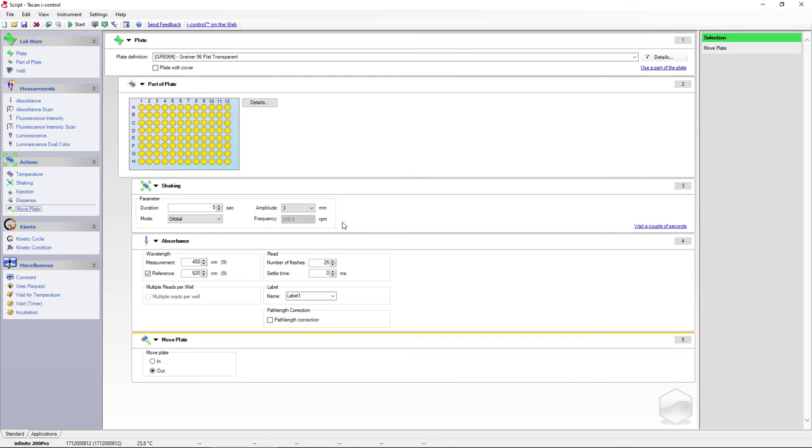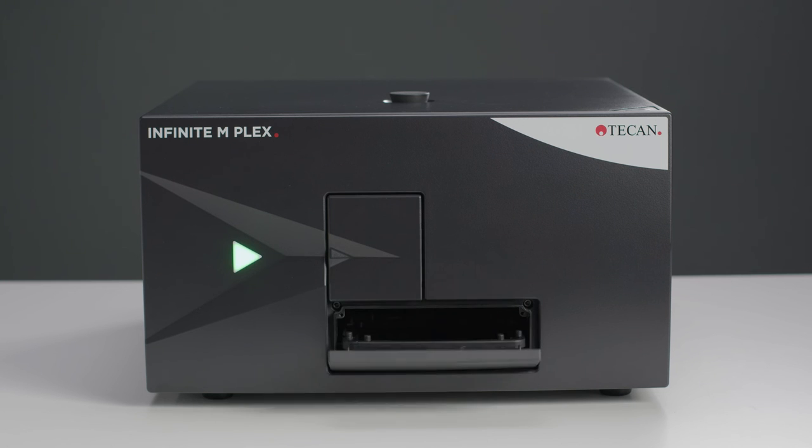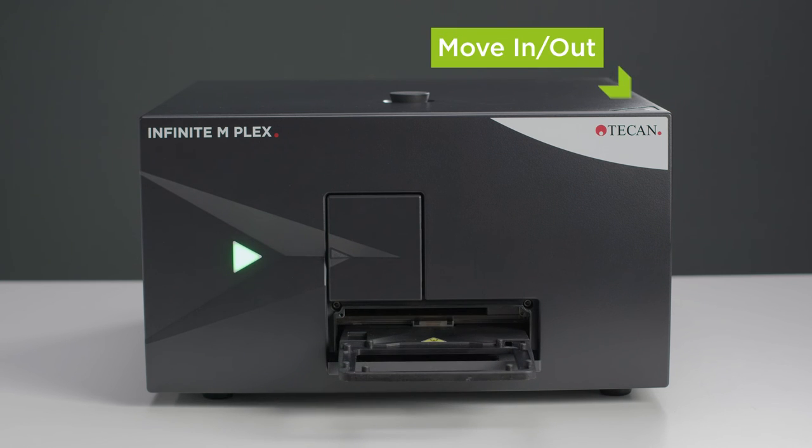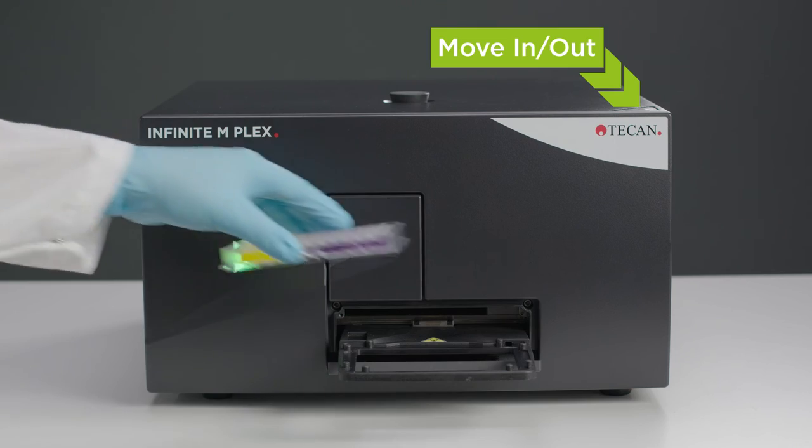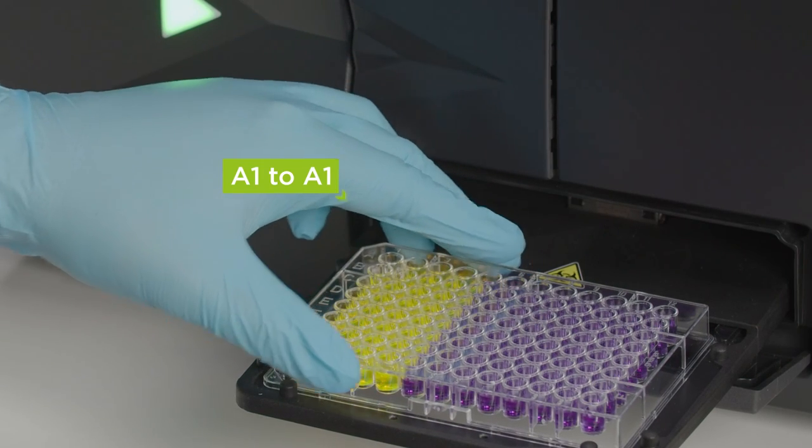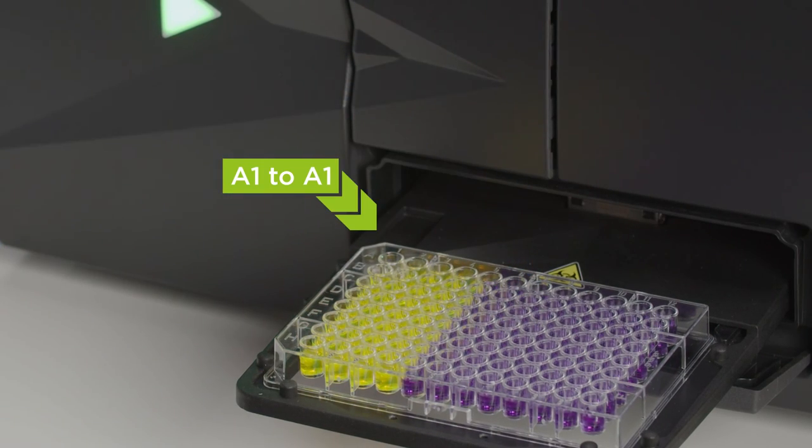Now that we have defined our parameters, we can look at the measurement. Move the plate carrier out using the software or by pushing this button. Put the plate on the carrier in the correct orientation and move the plate back in.